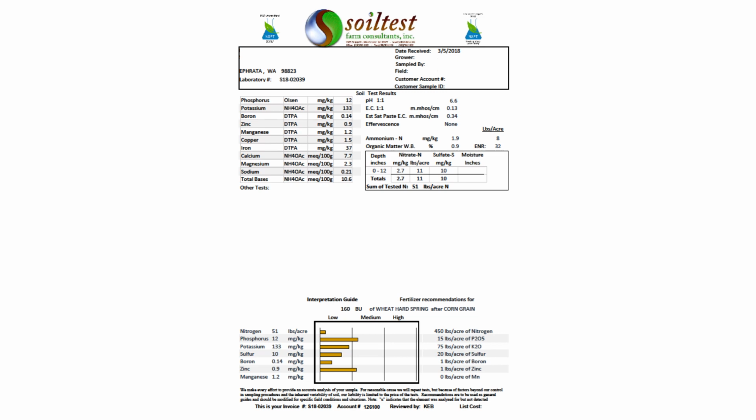There are a few reasons for this, but the most important one is that we do not calculate pounds per acre of these other elements because in order to make an interpretation of the data, we have to know parts per million. None of the fertilizer recommendations that were developed by Washington State University, Oregon State University, University of Idaho, that are the basis for our recommendations, use pounds of phosphorus per acre. They all use milligrams per kilogram. There are other reasons, but we won't get into it in this discussion today.